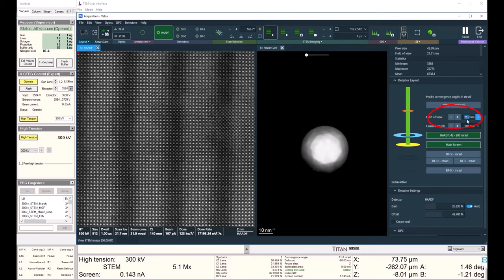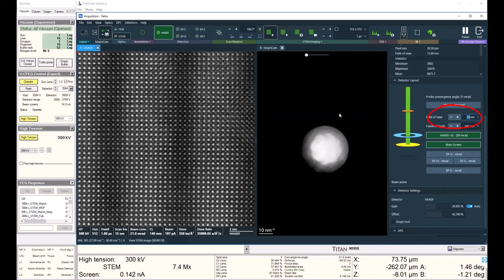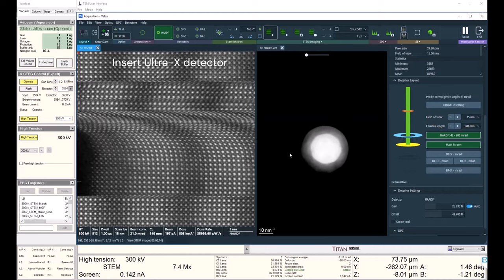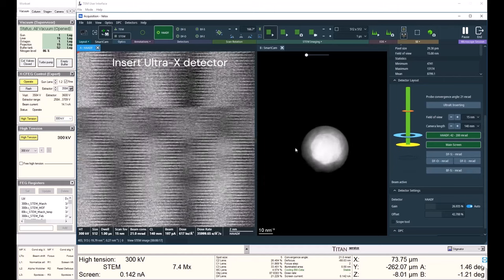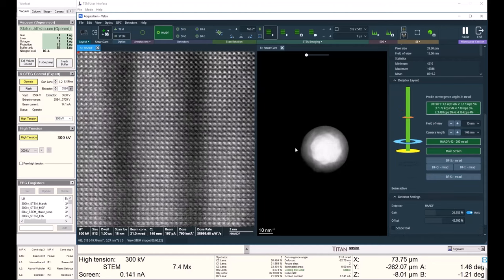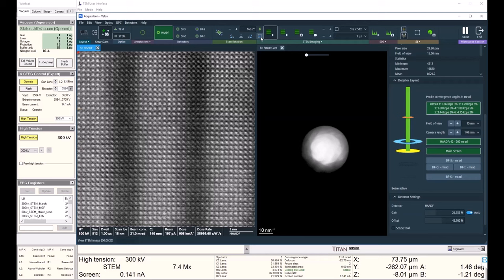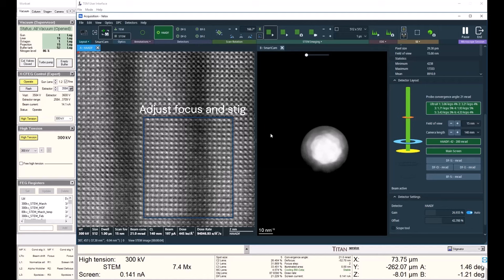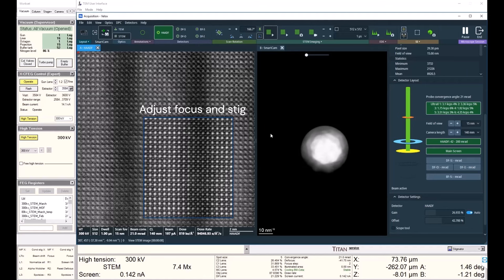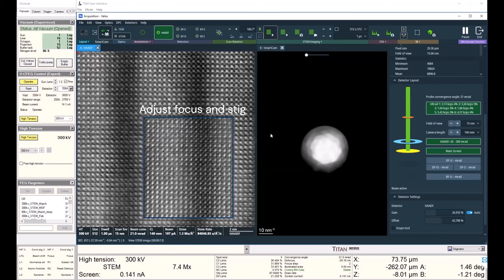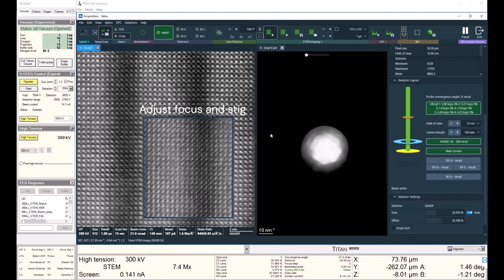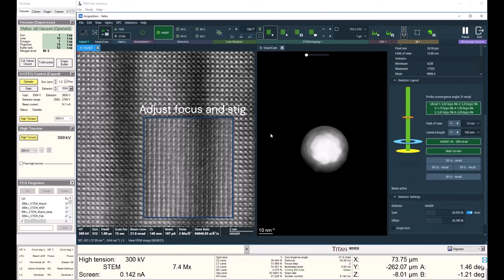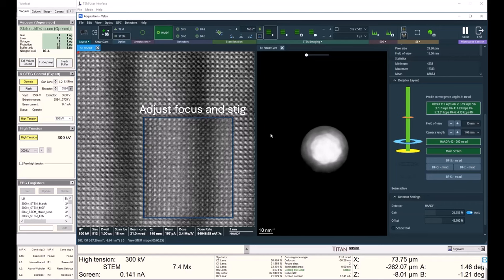I'm going to use a 15 nanometer field of view. And now I'm going to put in the Ultra X. You can see how quickly the Ultra X inserts. And once it's inserted, we'll just check our focus and stig once again, which don't go too far off with the insertion of the Ultra X.